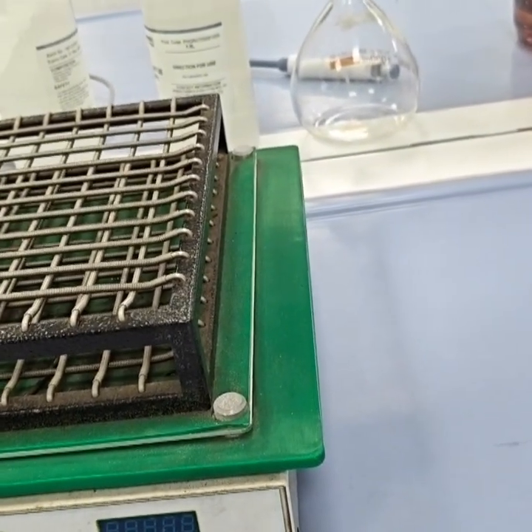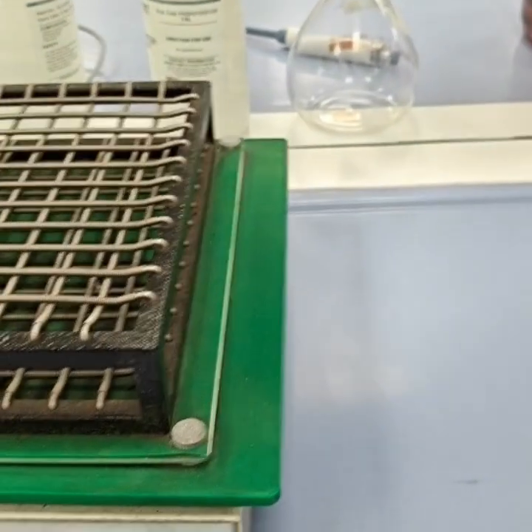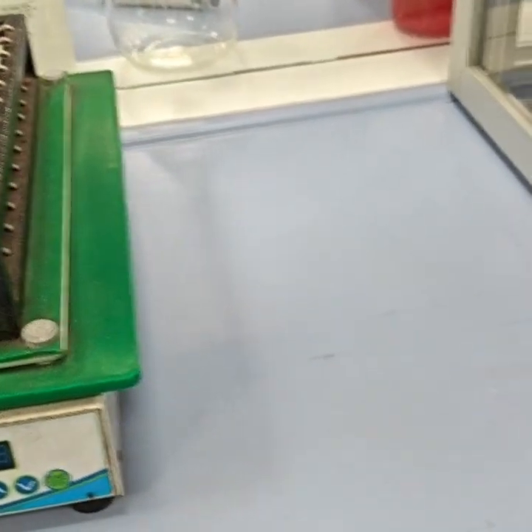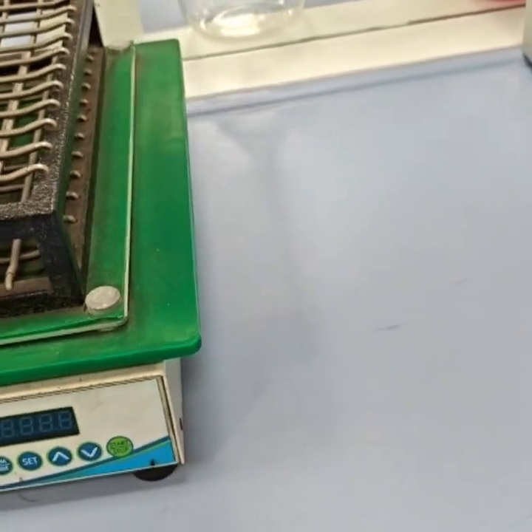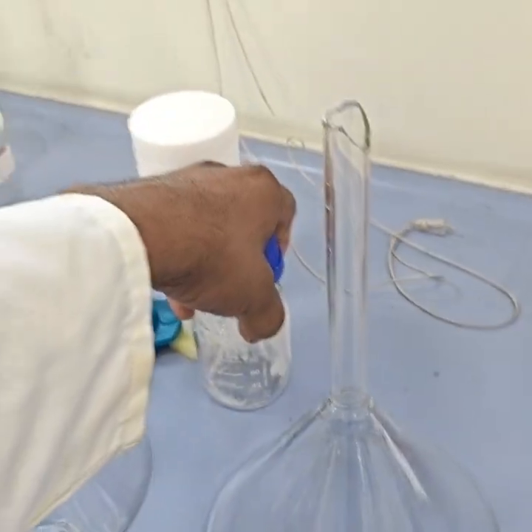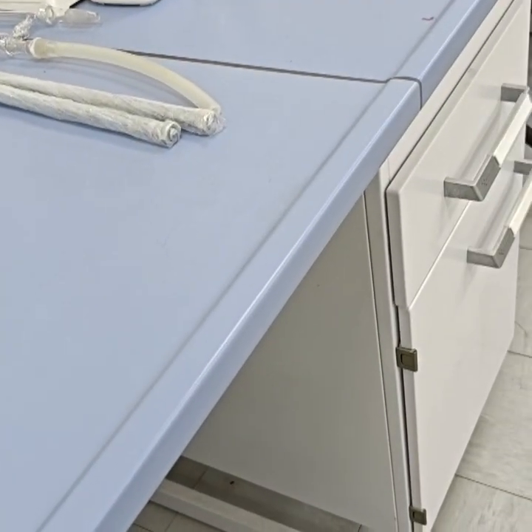Now if you are doing, for example, pH, you have to store your samples in a polyethylene bottle. And for dissolved oxygen, we usually prefer a glass bottle. It could be like this, not this kind of bottle. You can store your samples for the BOD. For pH, polyethylene bottles, they are a special kind of plastic. Maybe it could be this one.